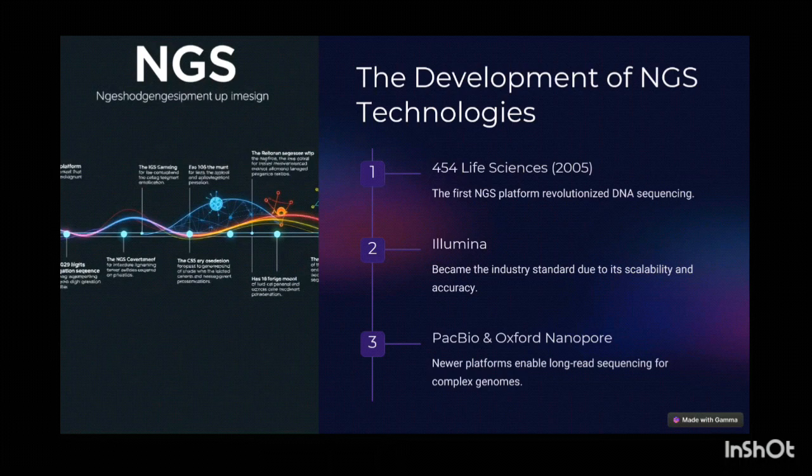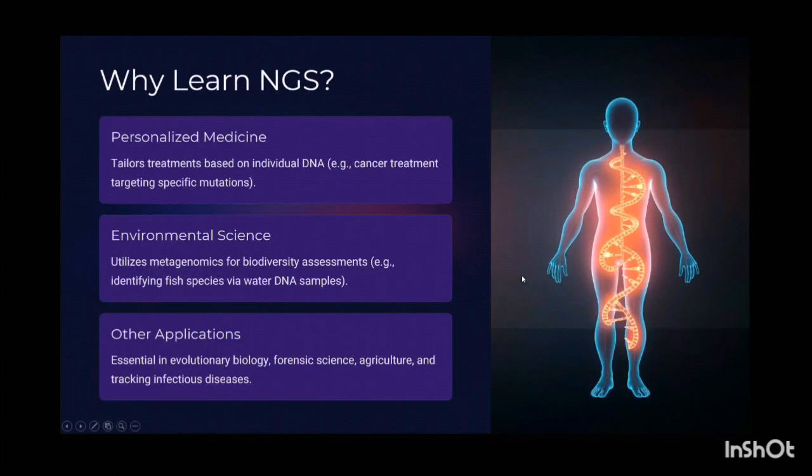So why do we have to learn NGS? What's the purpose? NGS has broad applications across many fields of science. In medicine, for example, it is a key tool in personalized medicine.